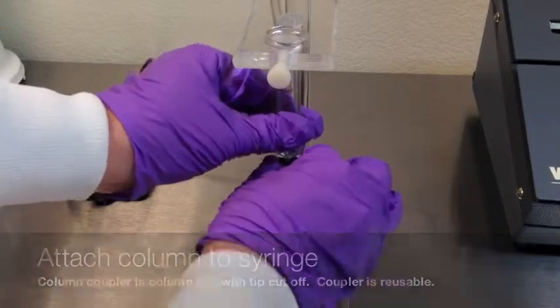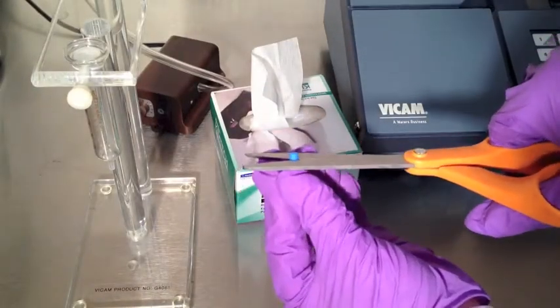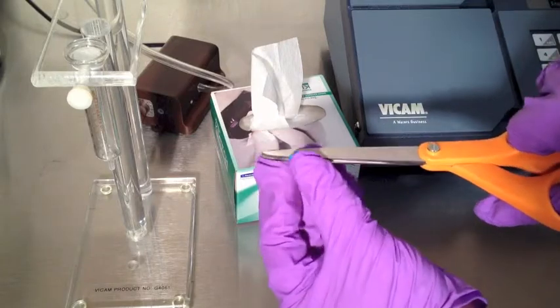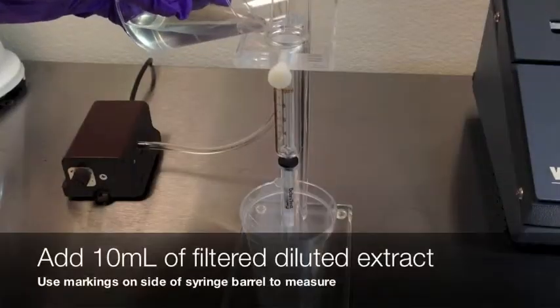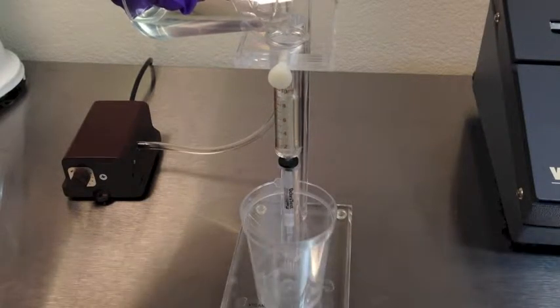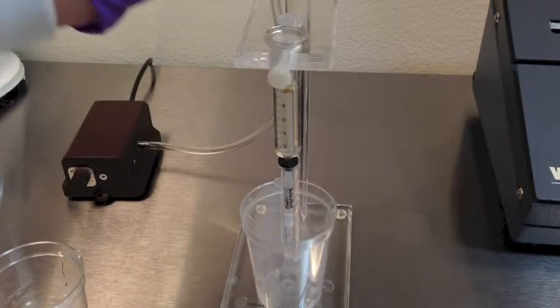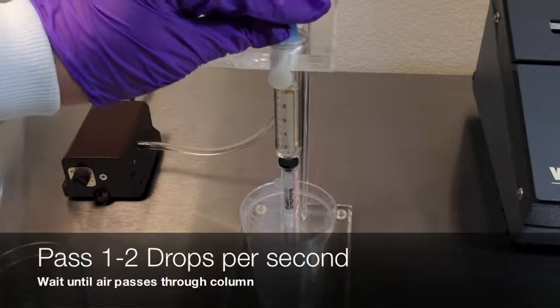Attach the column to the bottom of the syringe using the column coupler, which is a column cap with the tip cut off. This coupler is reusable until lost. Add 10 milliliters of the filtered diluted extract to the syringe barrel, using the markings on the side to measure.